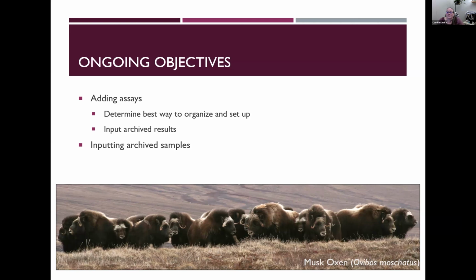When we do have an error, let's say an animal turns out to have had a different ID, turns out to be the same animal that we learn later on, we can very easily reattach those samples to the correct animal ID. We can change which sample events it's associated with for each of those samples without having to go in individually. We can do that in bulk. So there's a lot of tools that we have for doing some of those corrections that have been fairly laborious on our other methods that we have been using over the years.